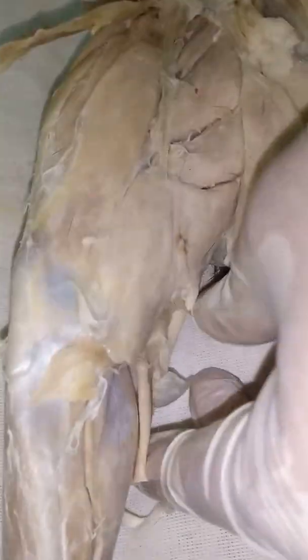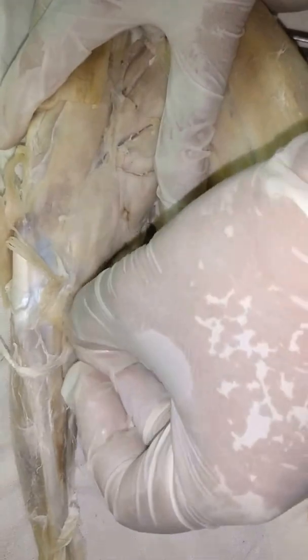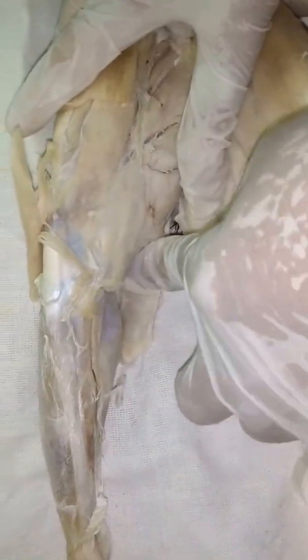If you look deeper underneath the semimembranosus, there is also the semitendinosus. It is attached there and you can deflect it.